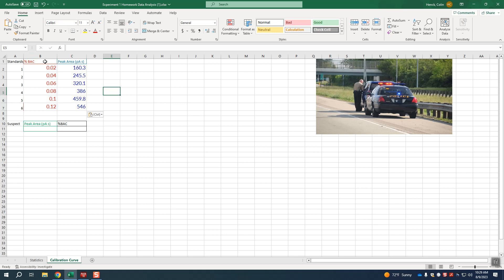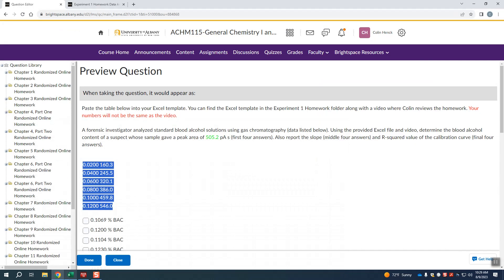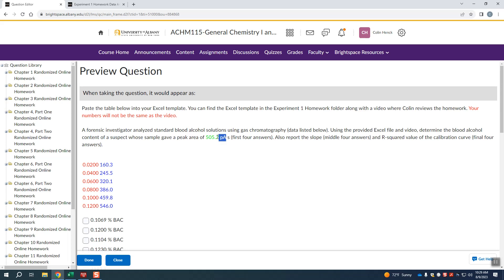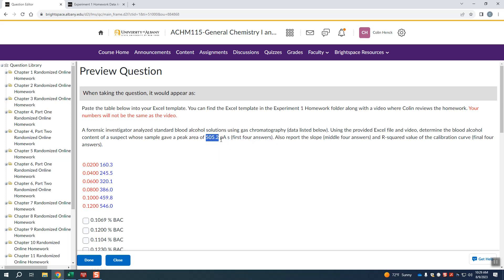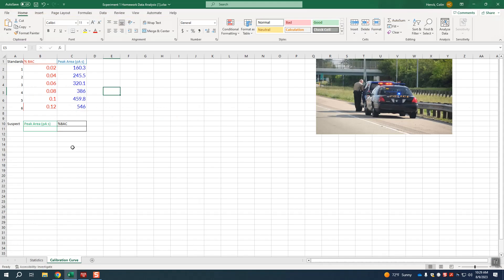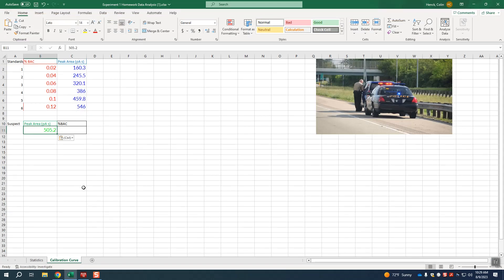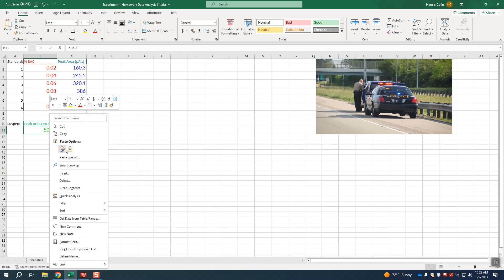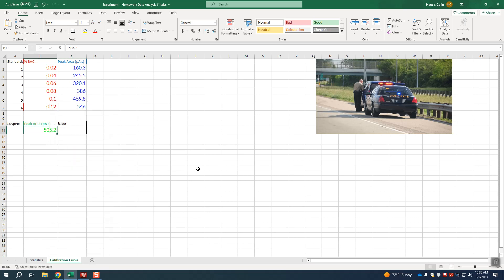So you'll notice these are highlighted as red and blue so we know where to paste them. And we're also going to need to paste in this green value here, which is the unknown. Don't grab the units because Excel doesn't know what to do with letters. Just grab the number and you can paste that in like that as well. So now we have our data in here.